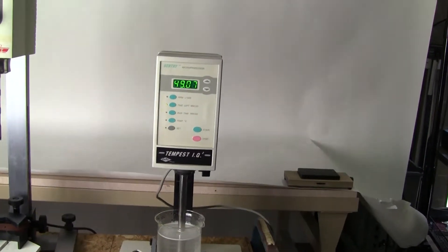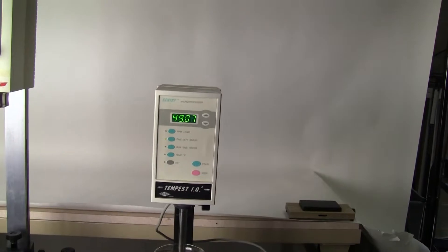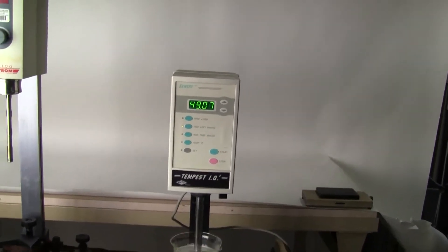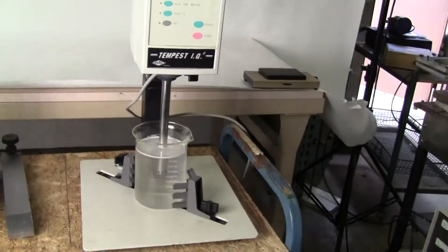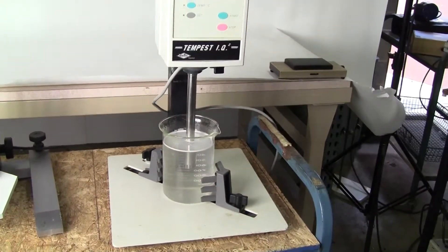Hi, this is Jim from HitechTrader. Today we're looking at a Vertis Tempest IQ2 homogenizer. It comes with a stand and has an 18 millimeter flat bottom stator.